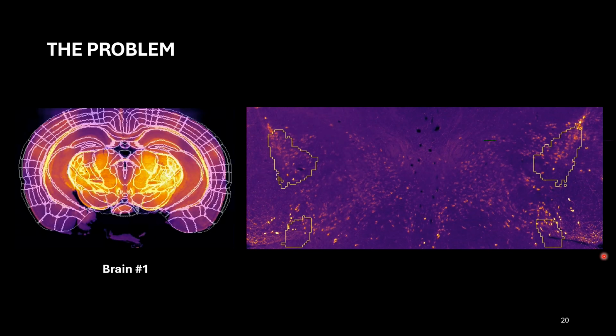Well, no, absolutely not. The problem turned up when we were going a bit deeper into the results and sharing that with our collaborators. So when we applied the registration, again, not a neuroanatomist, but all I have to go off is what the boundaries look like on the data. And so, the registration looks pretty good. It looks like the boundaries are quite tight on the tissue. Some of these big structures look like they're aligned pretty correctly. And then when we look at the region here, we can see it looks like it's capturing most of those cells.